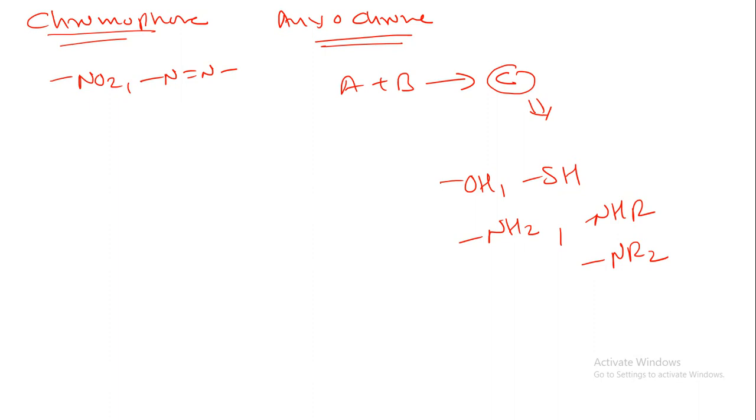So in today's lecture we will be studying the instrumentation part of UV spectroscopy. In any spectroscopy you have to remember that instrumentation is the most important segment.